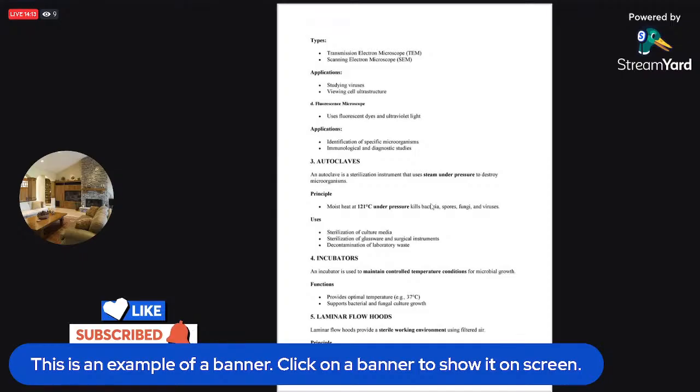Under pressure, it kills bacteria, the spores of fungi, as well as some viruses. So how do we make use of it? You use it for sterilization of culture media.